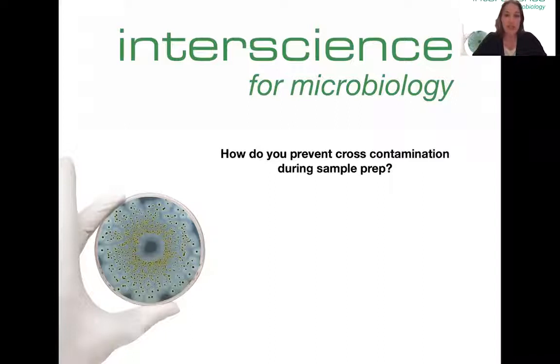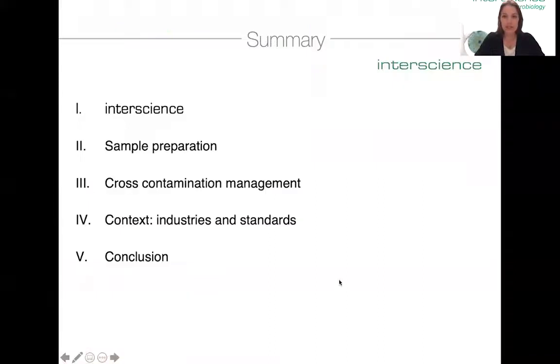All right, so I'm going to present what we're going to discuss today here. So very briefly, I'll introduce the company just to get us started, and then I will talk about what I mean by sample preparation. So here, it's really having a solid sample that you need to extract microorganisms, so yeast, mold, bacteria from, and then to run bacterial analysis on this or quality control or whatnot on your sample. So we're starting pretty upstream in this microbiology process.